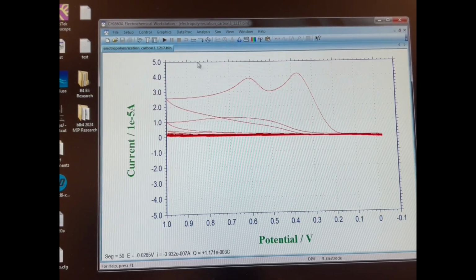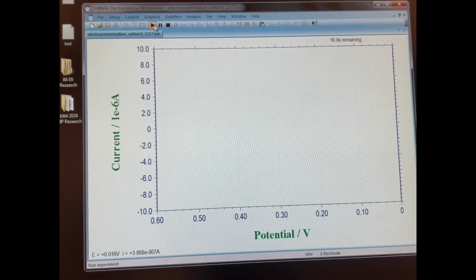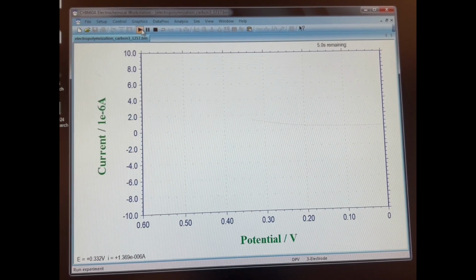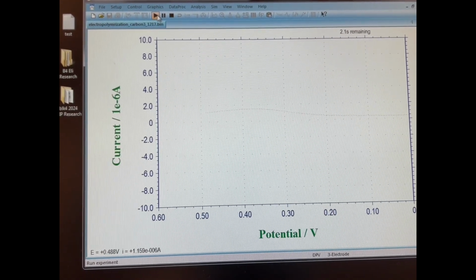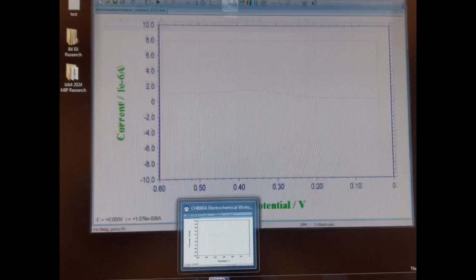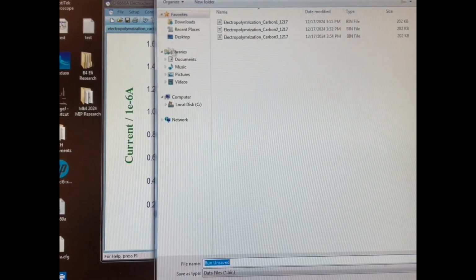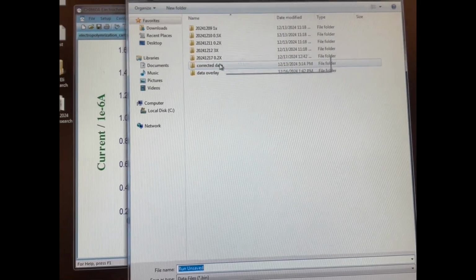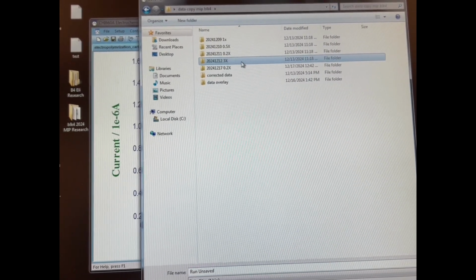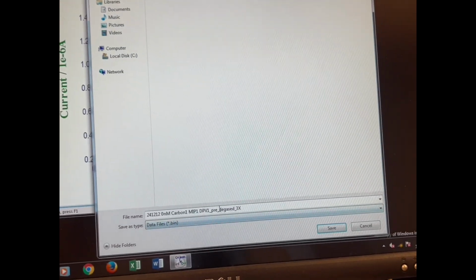Also click the big T and select DPV and enter the parameters. After we make sure everything is connected well, we click the little black triangle and let it run. This will not take 15 minutes. It will be very fast. And then we will click File and save it, and give it a name with the date and maybe concentration, and we'll also mark it as electro 1, electro 2.